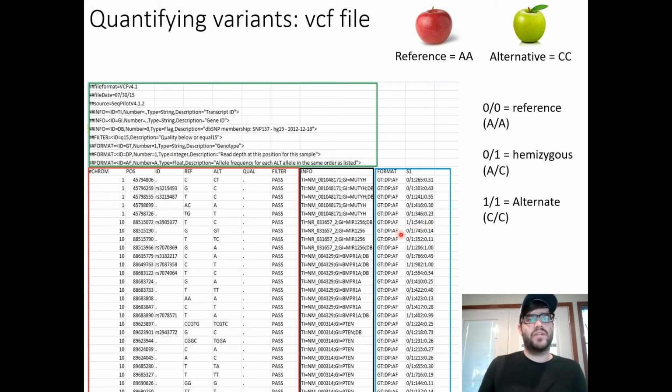We also got some weird stuff like allele frequencies of 0.14 or 0.11. We would expect it to be basically 0.5 or 1. I don't know what's going on here. These could be low quality ones, so then we would want to filter this. And what's really important for downstream analyses is this genotype matrix here, and we can use this to identify differences between individuals for maybe a GWAS, or genome-wide association study, or maybe some quantitative genetics, or we can use this and convert it into a binary character matrix and look at differences between individuals, which we'll talk about in the next slide.